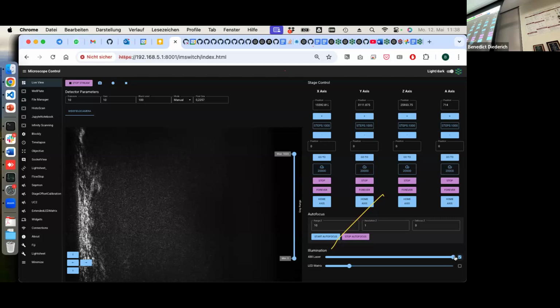Pretty cool. And here, to be very precise, to really see the 3D structures of your eye, you could use only one wavelength, but you have many of these wavelengths, so you measure in red, green, and blue. And then for every color you have a different wave interference pattern, and you get better 3D sectioning than with one. Yeah, it's a pretty cool technique. So, OCT, optical coherence tomography. Yeah, and also there was somebody indeed building this, just to emphasize the cubic.